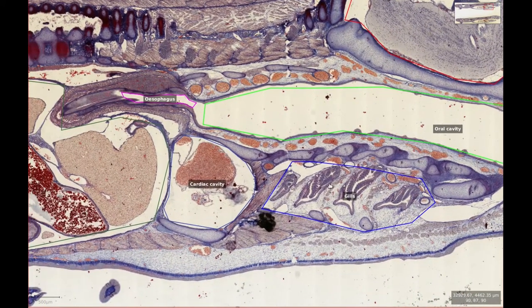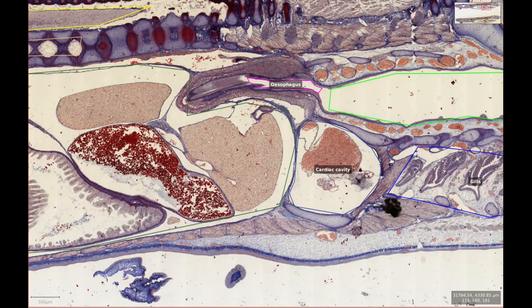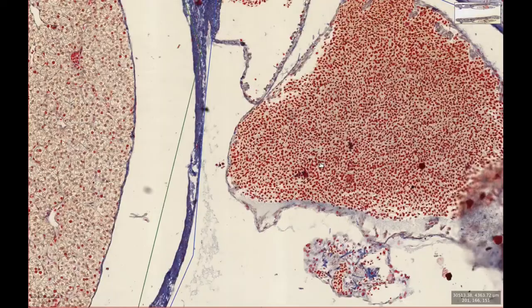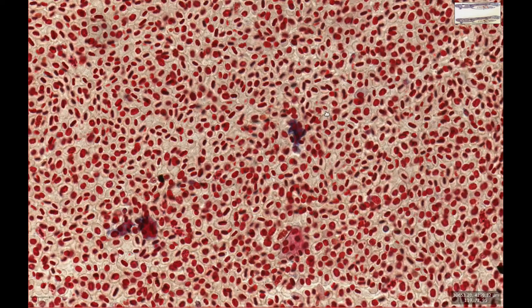Heading caudally, we begin to get an idea of the body plan of a dogfish. Just behind the gills there is a small body chamber. If we zoom in, we can see a membranous sac filled with lots of ovoid cells with oval nuclei. These cells are red blood cells, which are nucleated in all species apart from mammals.